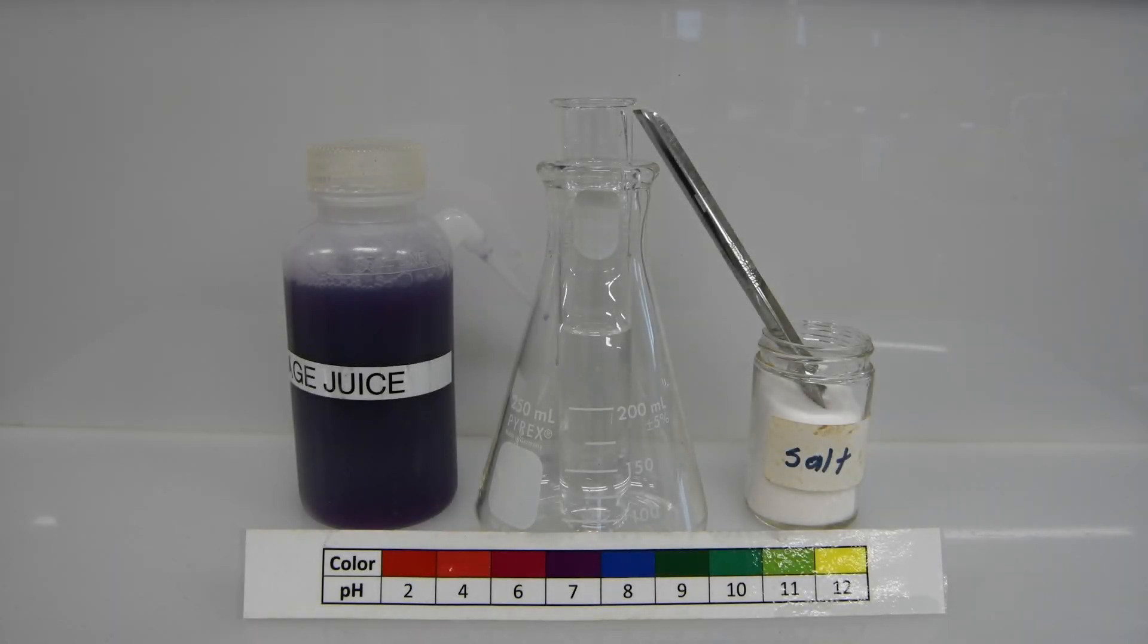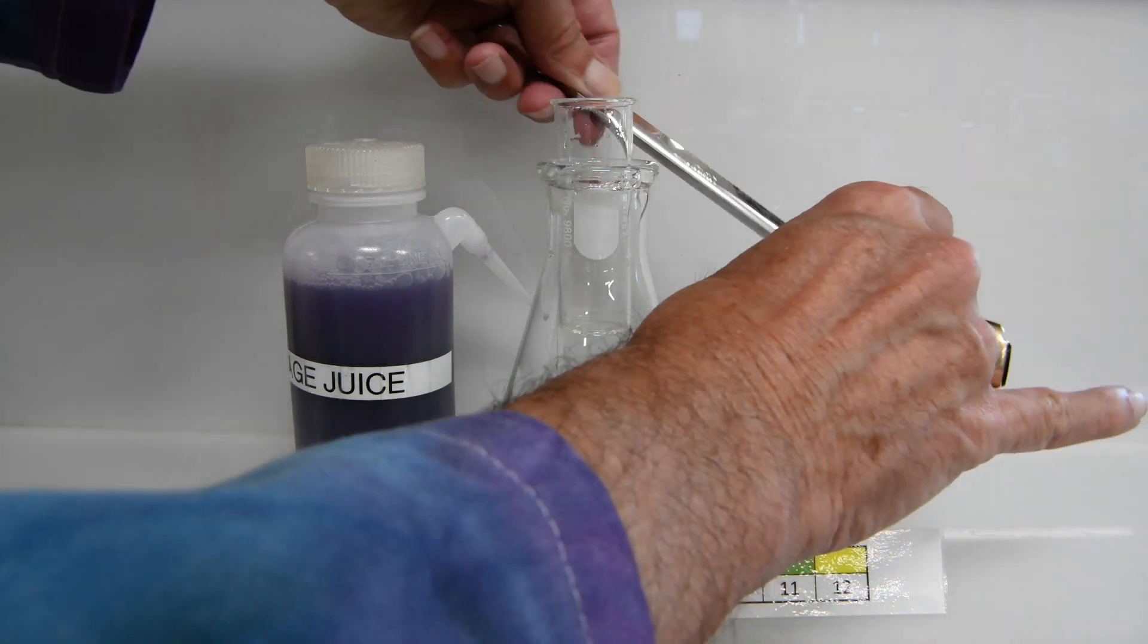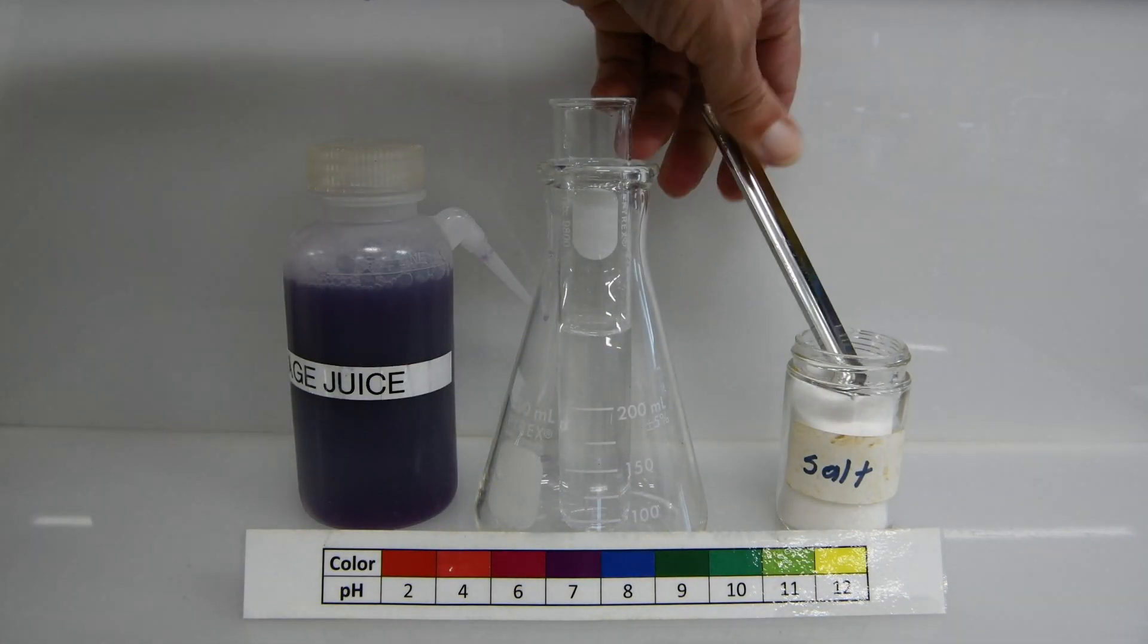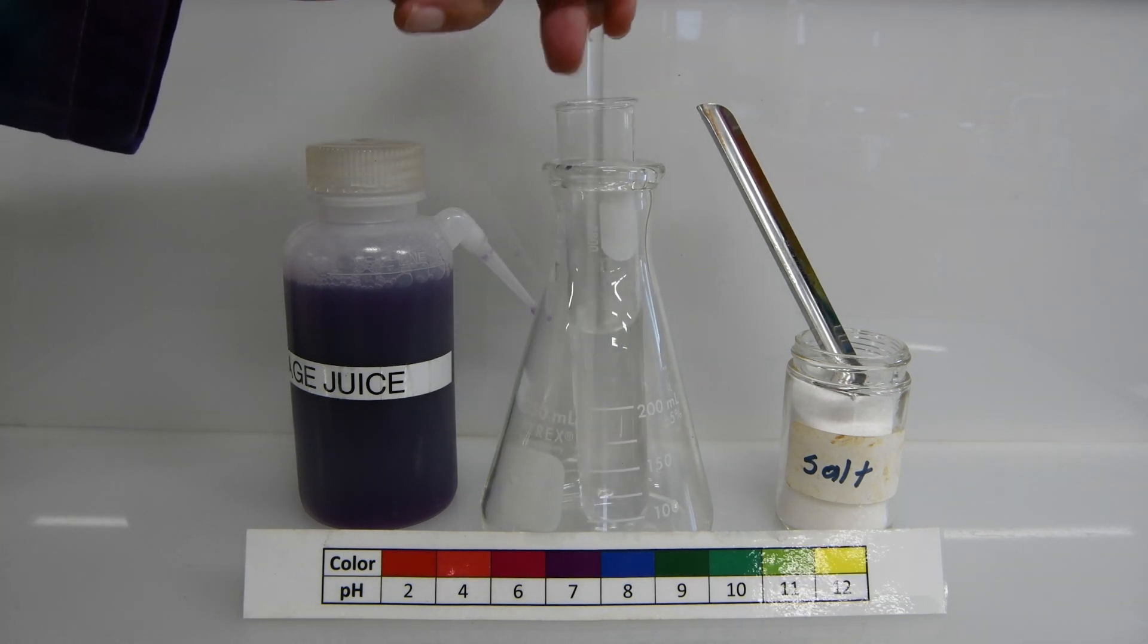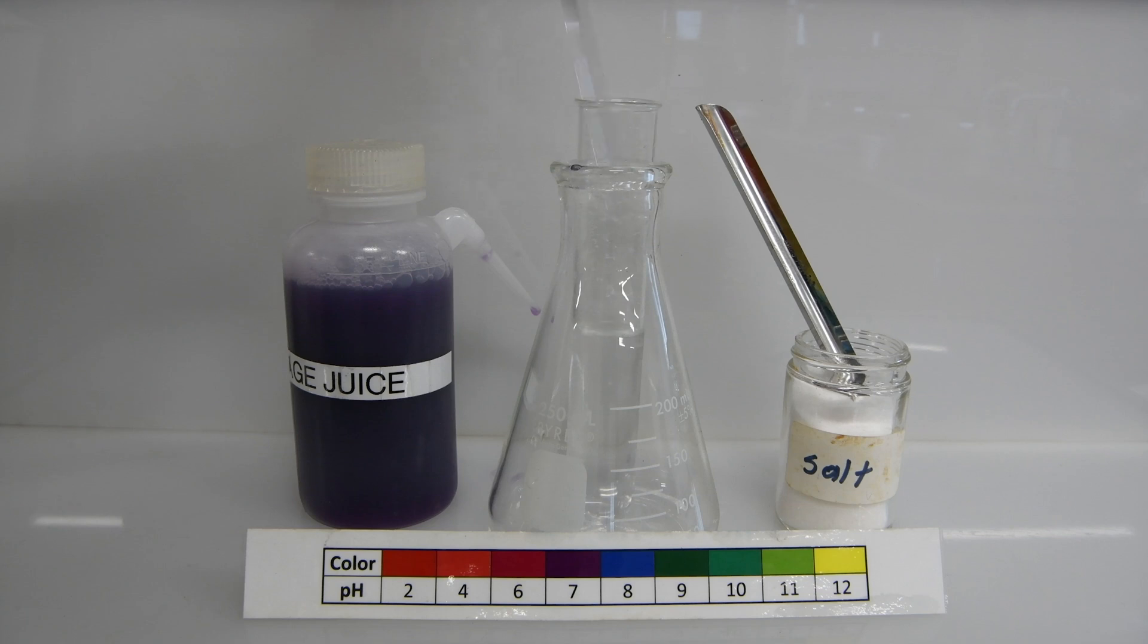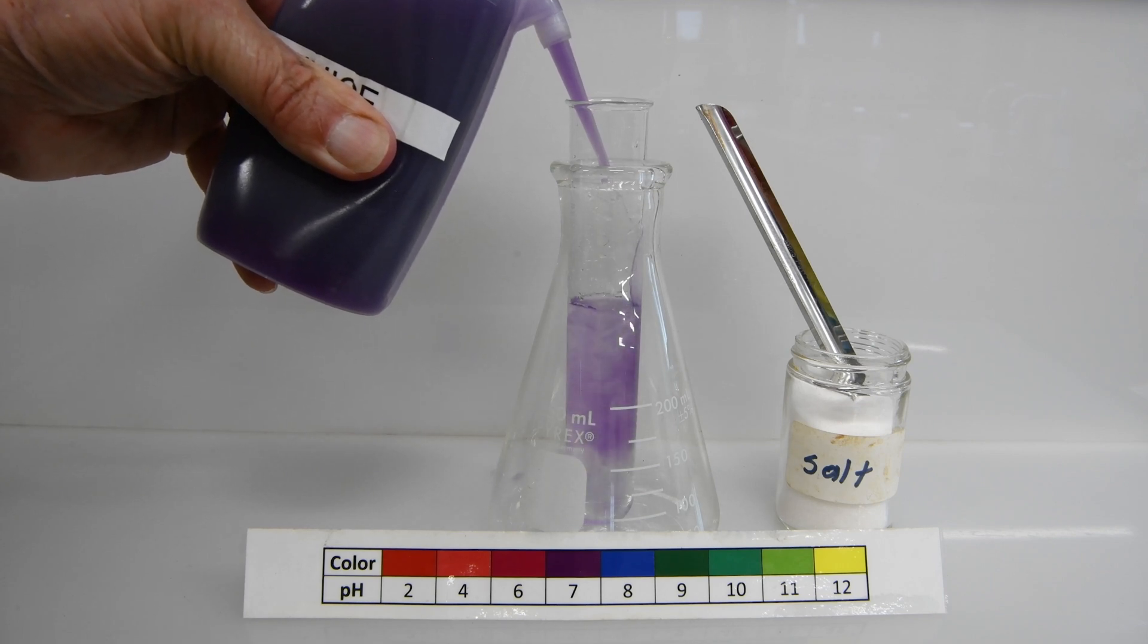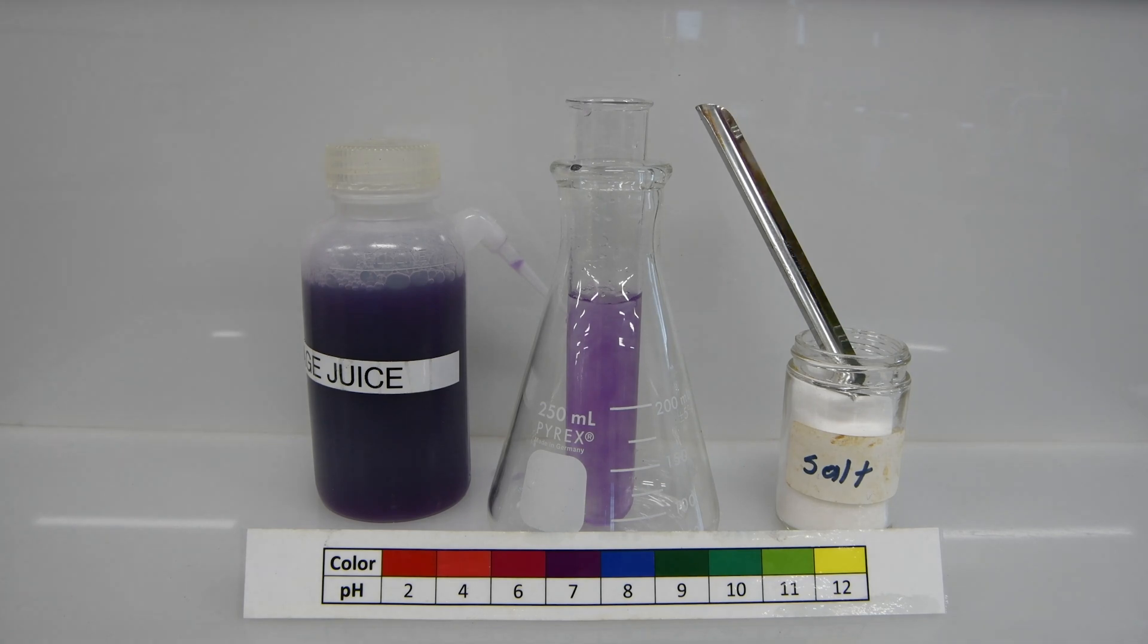Now we're going to test some table salt. So we'll add a little bit of salt to our test tube. Go ahead and stir that around to get it to dissolve. And then add a bit of our cabbage juice. And it appears that much like the sugar, the color has remained unchanged.